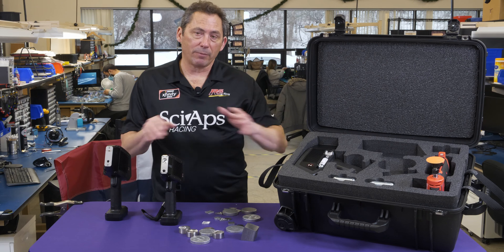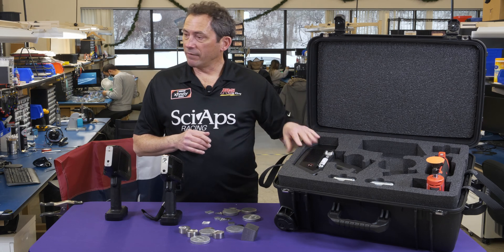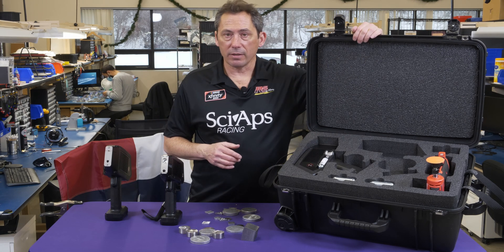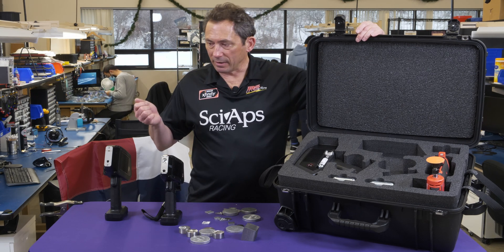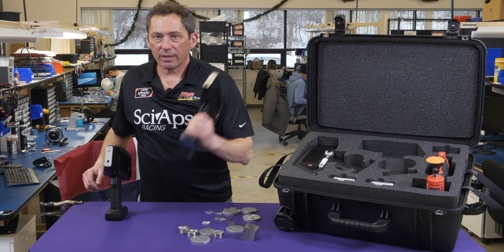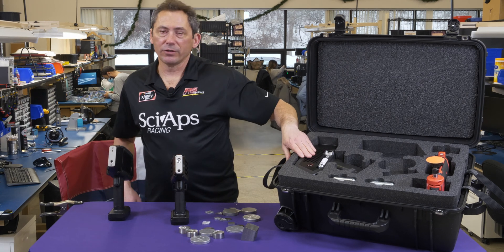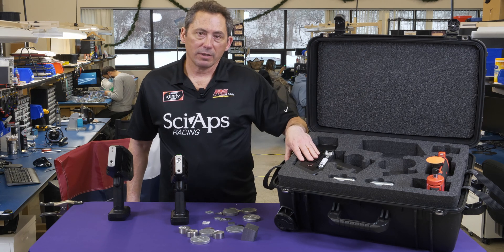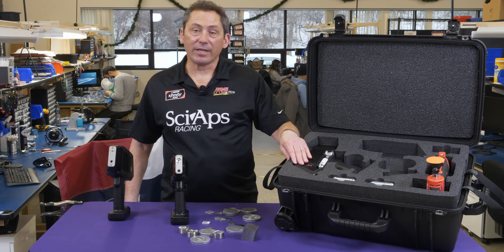We still make a LIBS system that does everything — that's still out there and people are still using it. But a lot of our customers that already have XRF want just a carbon unit, or more importantly, some customers just want to use XRF for what it's great at and LIBS for what it's great at, and put them together in this one-box package — XRF and carbon into the one box. We have multiple versions of this at different price points, depending on how advanced or how standard your PMI efforts are. Thank you.